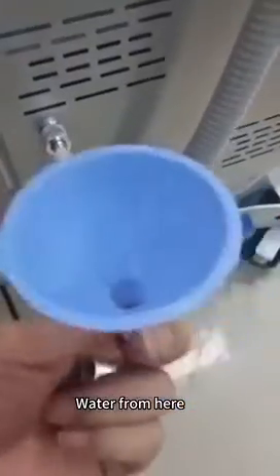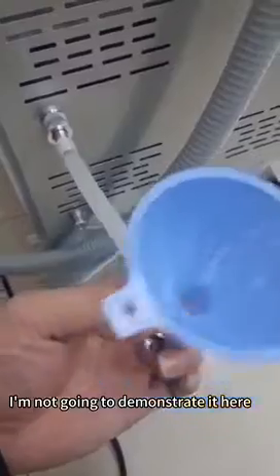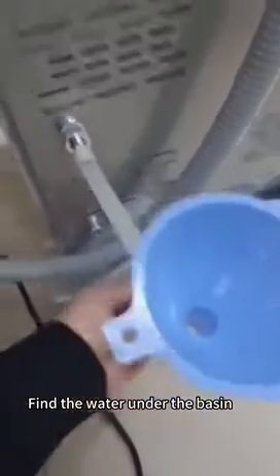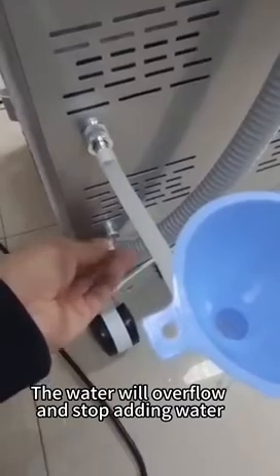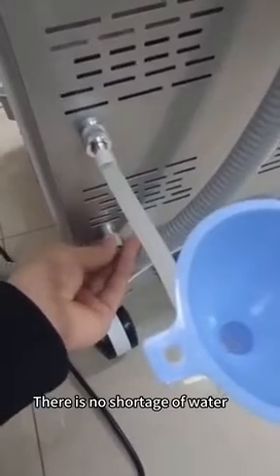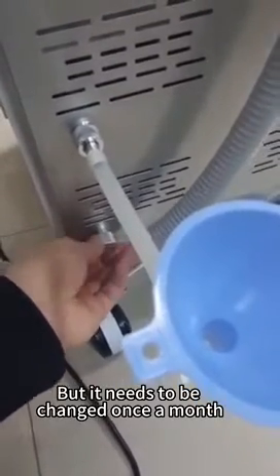Water goes in here. When this instrument is filled up, find the water basin underneath. When the water is filled, it will overflow — stop adding water at that point. Cover the overflow hole. The system works in a loop, but the water needs to be changed once a month.